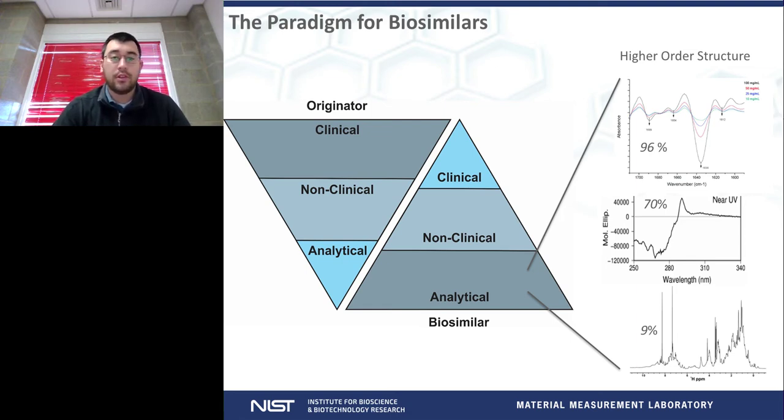evaluate and determine the usefulness and safety and efficacy of these protein therapeutics is inverse between the originators and the biosimilars. So when we deal with originators, typically we do some developmental analytical work. We then proceed into some non-clinical based tests and trials, and then we move into clinical trial where we determine the potency, the efficacy, as well as the safety.